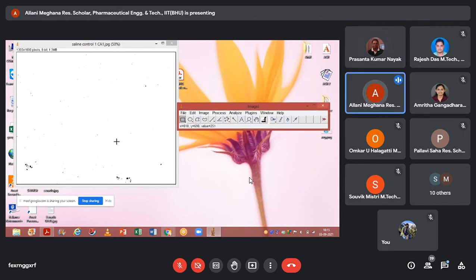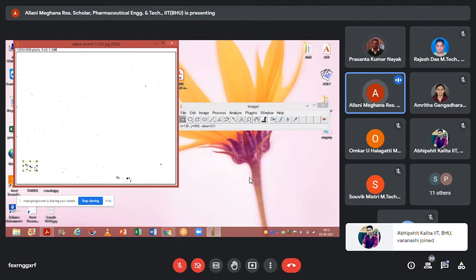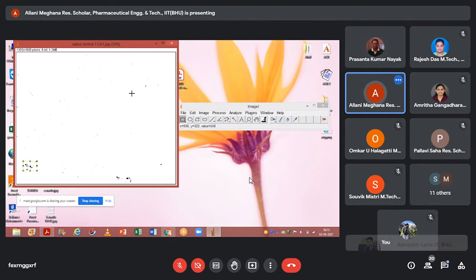After putting in the threshold values and checking, you can see a plus mark running over your image when you put the cursor on it. Choose small areas, bits and parts, where you can find the intensity, the expression of cells, the CFOS expression, the black spots you can see here and there.